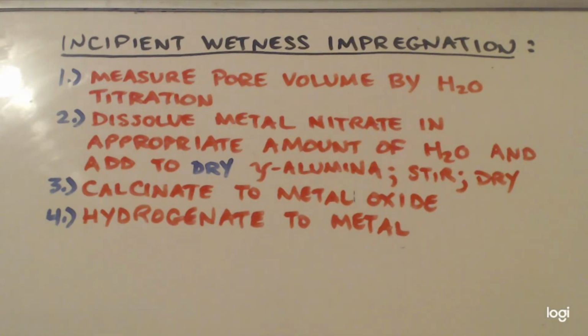I myself am first going to start out with just plain copper. I'm not even going to jerk around with having a catalyst support structure, because number one, copper by itself is better. It's going to want to make acetaldehyde and that's it. You know what I mean? There won't be as many byproducts that I have to deal with, but it won't last as long.